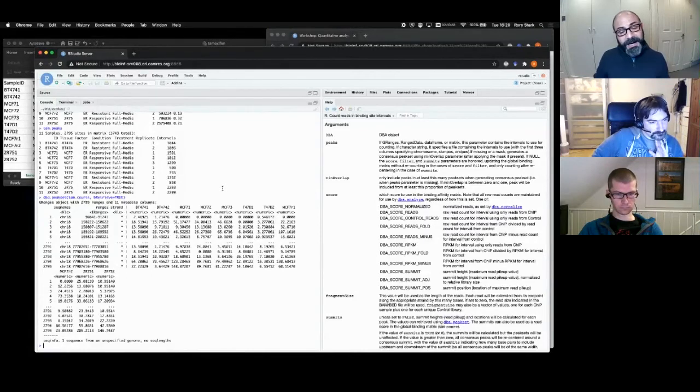These are actually normalized already. So there's a default normalization, just like we had the default consensus. Like I said, DiffBind's always trying to do something sensible. Here you can see, if I retrieve the binding matrix, I get a GRanges object with the 2795 ranges, and a normalized count for each. You can tell they're normalized because they're not integers.